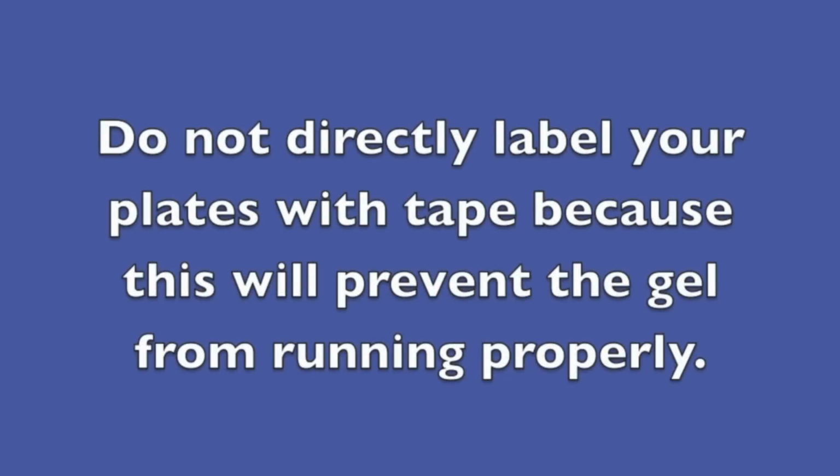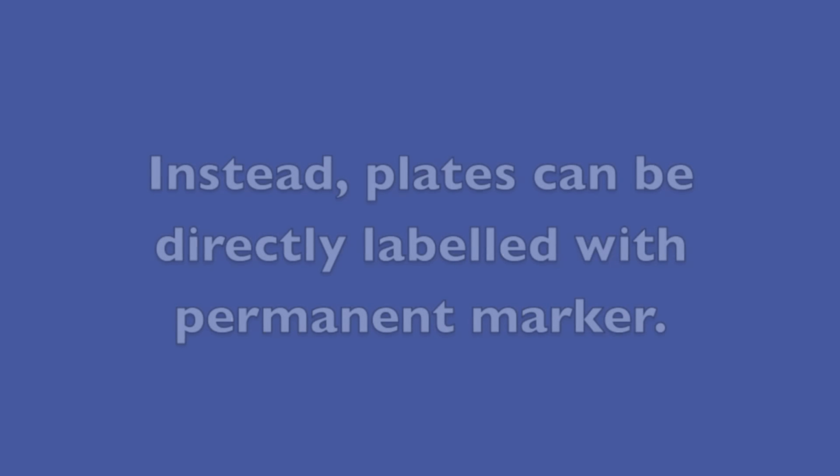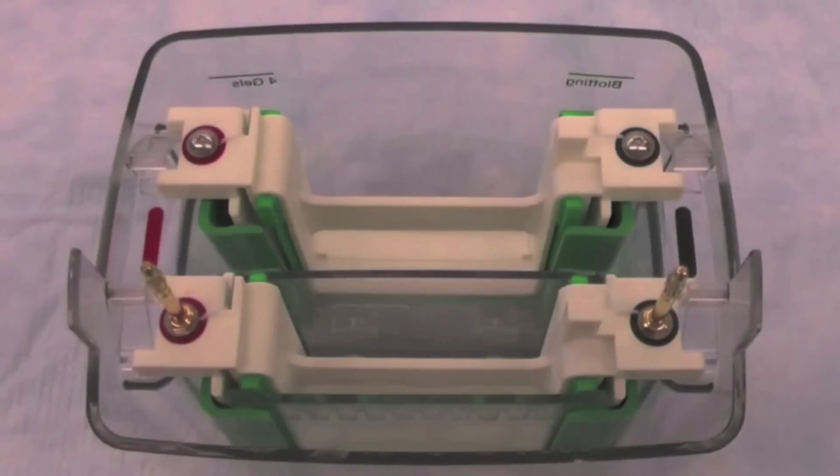Do not directly label your plates with tape, because this will prevent the gel from running properly. Instead, plates can be directly labeled with a permanent marker. Each tank can accommodate two running modules, which will be four gels altogether.